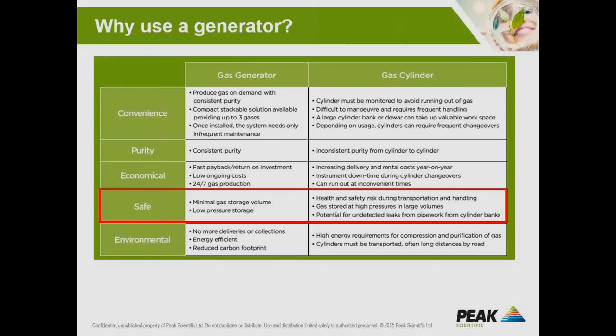Now, the main focus particularly when we look at hydrogen is safety, and so I'll dwell on the safety aspects of our hydrogen generator afterwards.